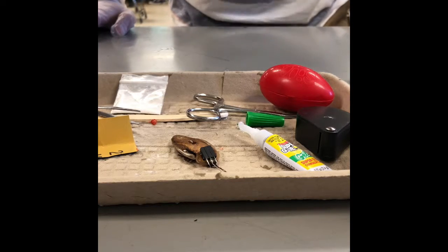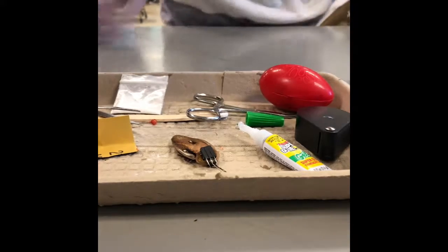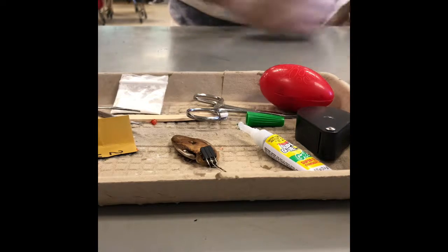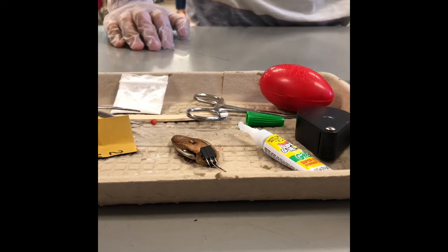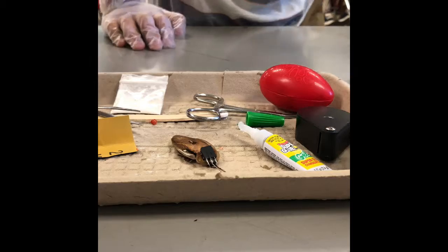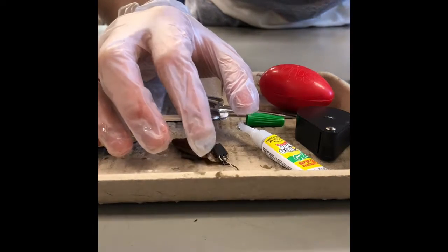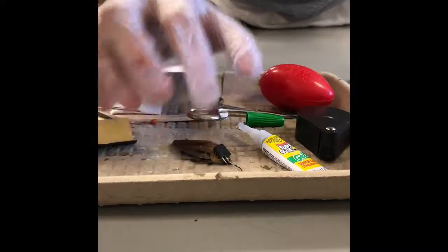To start with the Roboroach surgery, you're going to need the following things: sandpaper, a hot glue gun, superglue, cotton swabs, silly putty, a needle, toothpicks, scissors, tweezers, a cup of iced water, flour, paper towels, and your choice of a magnifying glass. Since the group didn't record the beginning steps, I will explain the beginning procedure with no recording.